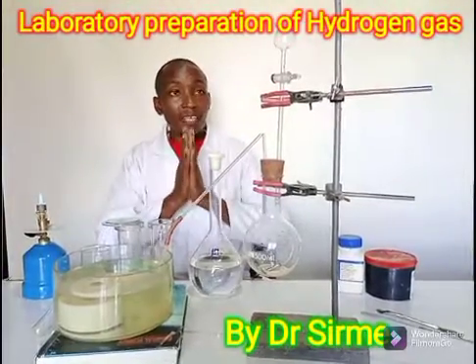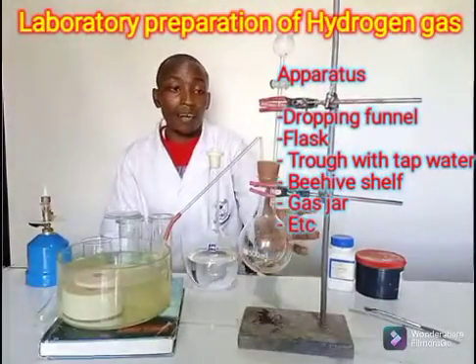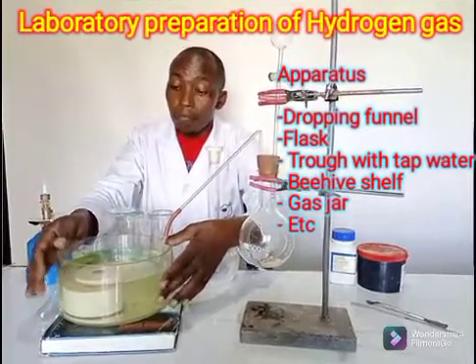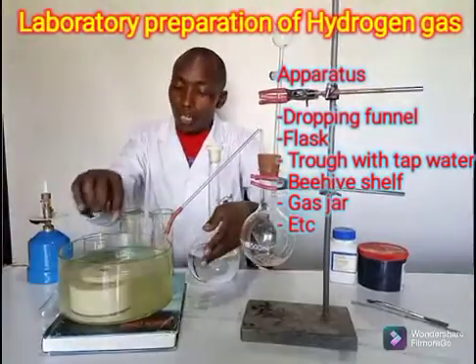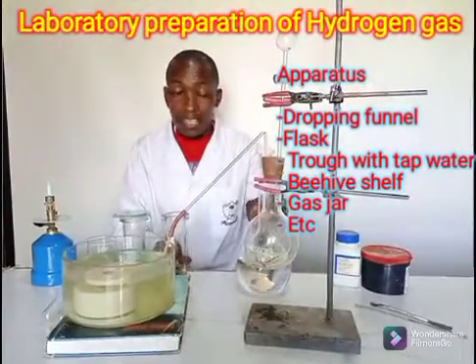So with that, the apparatus I'm using: I'm using a dropping funnel. I'm having a round bottomed flask — even a flat bottomed flask can do. Then I'm having a trough with some water, and a beehive shelf that will support the gas jar. So this is the setup that will help me collect the gas. Those are the apparatus.